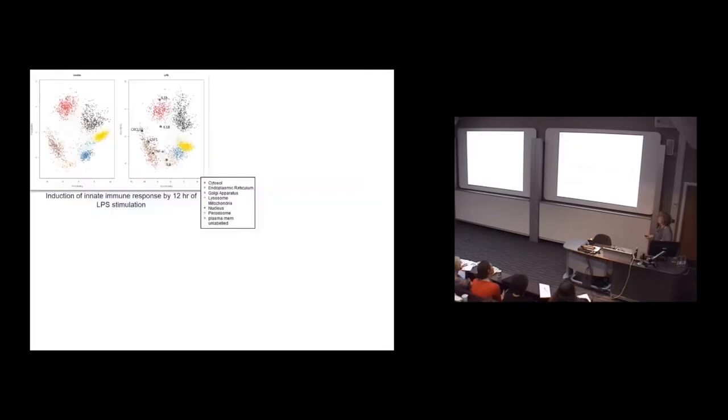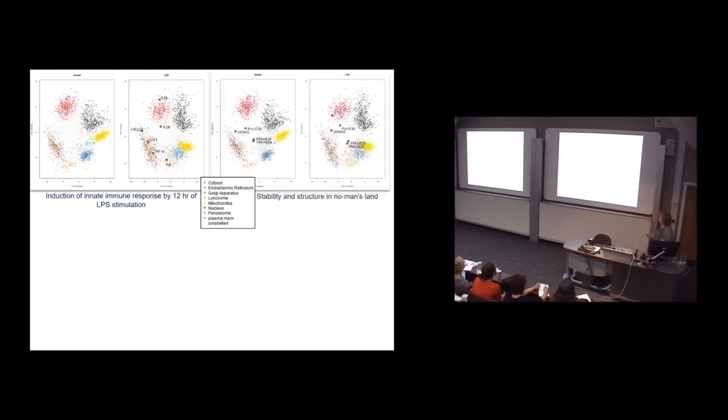So just briefly, this isn't published, but if we treat cells in different ways, and these were a monocytic cell line, which we treated with lipopolysaccharide, we can look to see what's changing with sets of proteins in terms of their location. So there are certain different features that you would like to see. For example, sets of proteins that appear because you've treated the cells in some way. So these are now expressed given the perturbation.